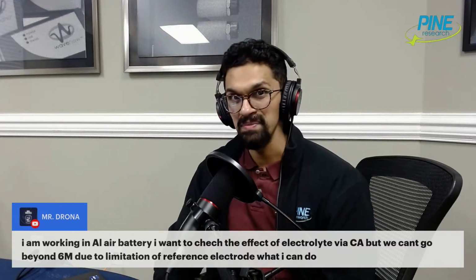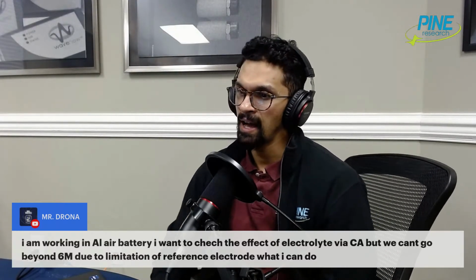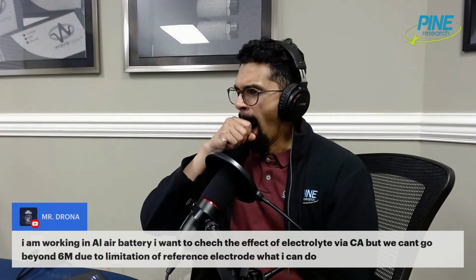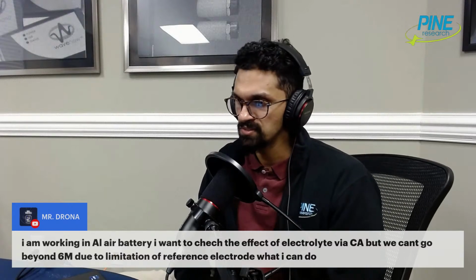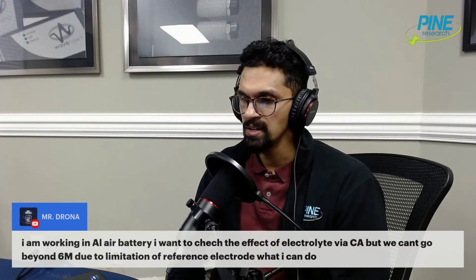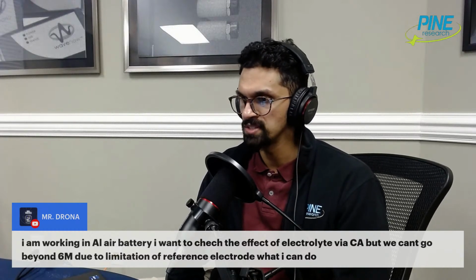So I'm not a big expert on batteries or aluminum air batteries, to know exactly how to address this specific situation. But it looks like you want to check the effect of the electrolyte via chronoamperometry. You can't go beyond 6 molar due to the limitation of the reference electrode. What can I do? So you're making it sound like the reference electrode is causing a problem.